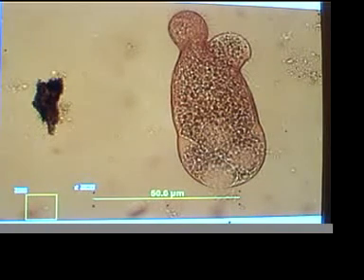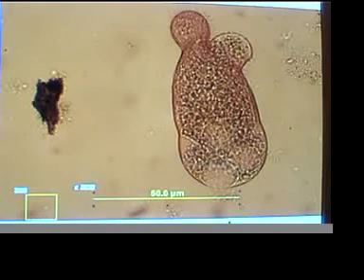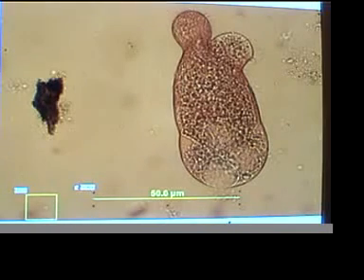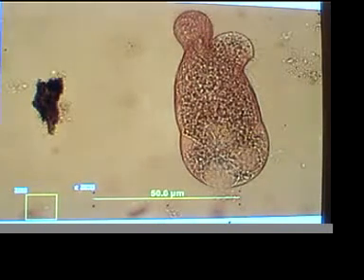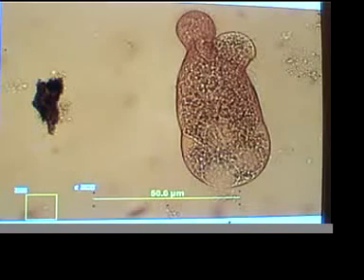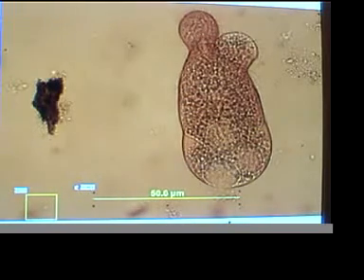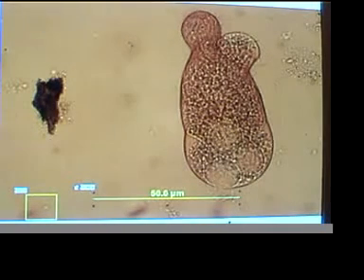We might stick with this guy. Let's see what happens over time. Let's see what we're doing at frequencies. Oh, 926, we're on the last frequency in the last minute. 1 minute to go. 926 hertz. Perhaps we have seen all the changes we're going to see in this organism.